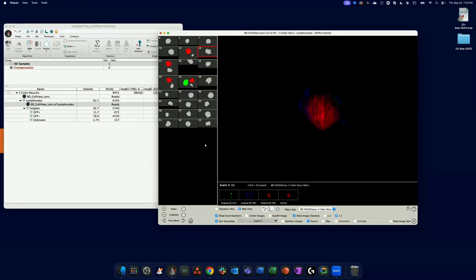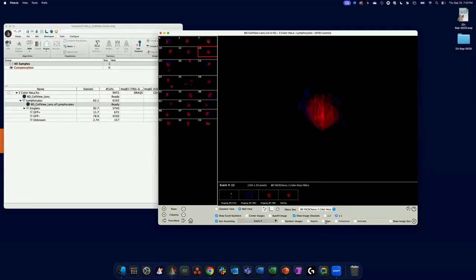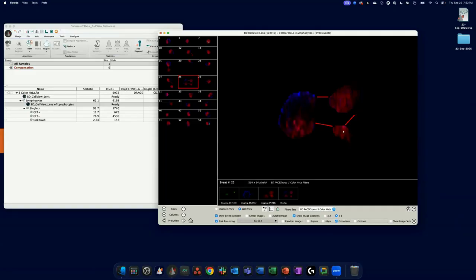So if you're trying to eyeball multiple cells in an image, that can help out. We can also outline the edges of the cell. We can have connections between cells. So for instance, here I can visualize this connection between these 3 possibly interacting or at least neighboring cells, and establish a centroid calculation as well. Okay. So those are all just visuals that can take place here within the plugin.